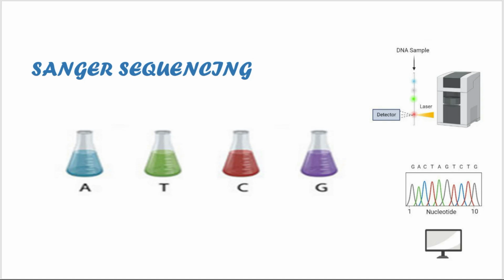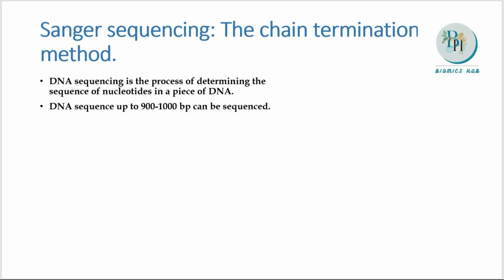Everyone, in this video we will be discussing Sanger sequencing. So what do we mean by sequencing? The first thing we have to know is what sequencing is. When we discuss sequencing, there are various methods, like Sanger sequencing, Pyrosequencing, and Maxam-Gilbert sequencing. So what do we do by this sequencing?